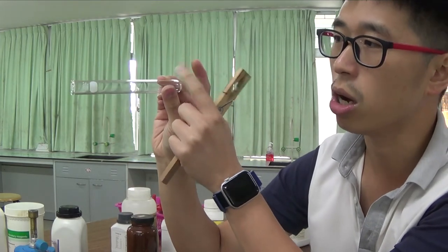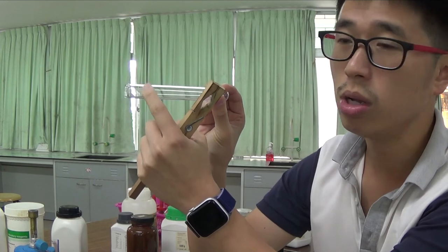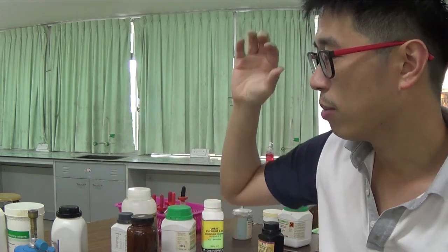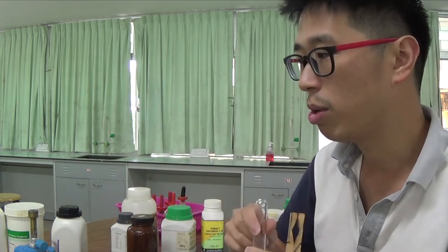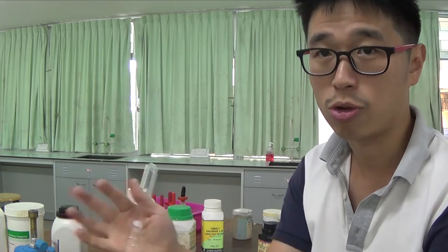You heat here, this is hot. The water vapor and steam reaches the upper part of the tube, which is cold. Then they will condense on the inside, and you will get a colorless liquid. Whether you started from the white solid or whether you started from the colored solid, if you get a colorless liquid form on the upper part of the tube when you heat it, okay, with a Bunsen burner, that means you have water of crystallization.